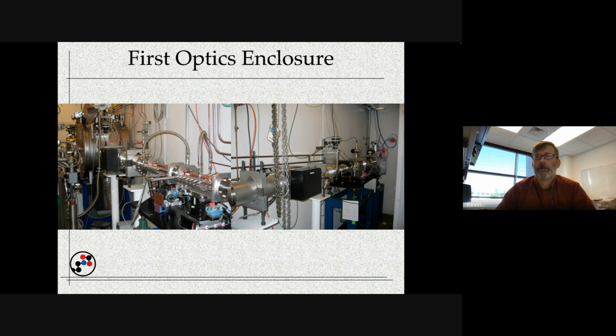So that will transit down this large vacuum pipe. This portion right here that has all these pipes and tubes on it is a series of slits that will reduce the size of the beam coming out of the storage ring before it goes into the monochromator, which selects the energy, which is this large circular tank here on the left-hand side of the picture.